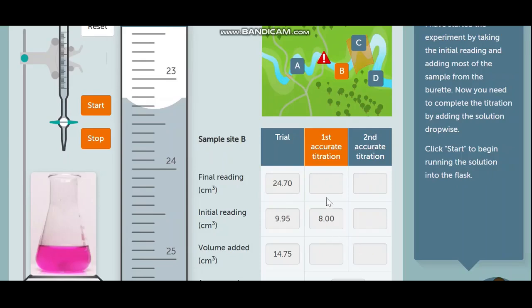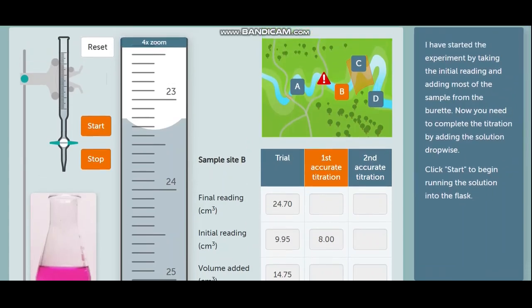But in this case, you must do everything completely. During WAEC and NECO, once you have done a trial, and the first is close to the trial, that means the second will not be different. You can just fill up the second one. We will learn more about filling up later.